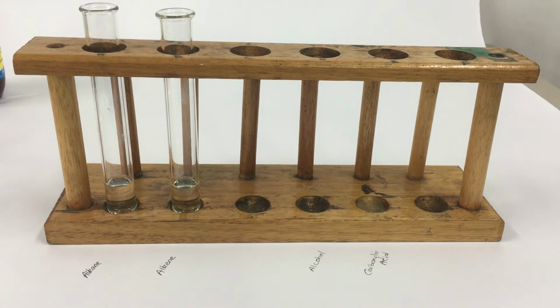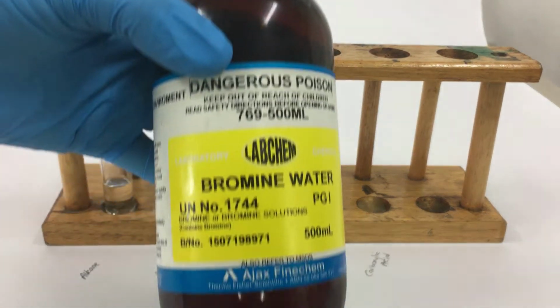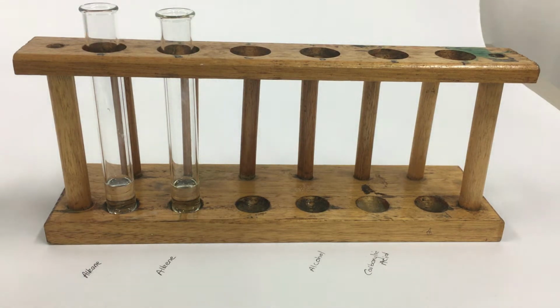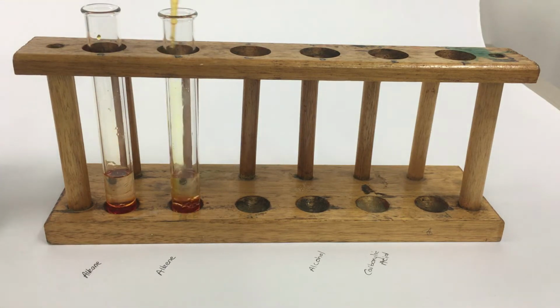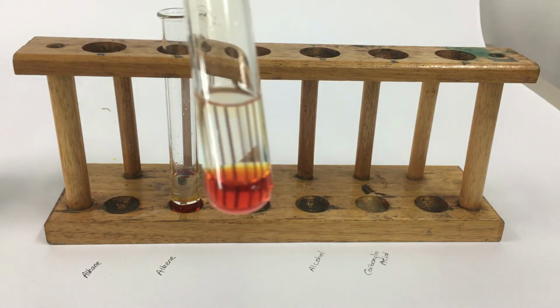Okay, so we're going to have another demonstration here. We're actually going to be using bromine water, so it's a solution of bromine bubbled through water, as simple as it sounds. We're going to use that as a test of saturation on the alkanes and alkenes here. So again, we're using cycloalkane and cycloalkene. And we'll see if we can come up here. So take a solution of bromine. So that's each of those. And you'll see quite a distinct orange colour that'll separate on here.